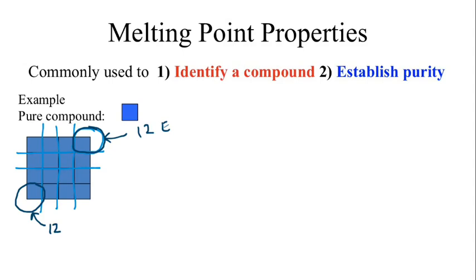Well, how are we going to monitor that energy unit? That's going to be with temperature. So if we're going to look at an ideal pure compound, all the intermolecular forces within that compound are the same. So when I hit the threshold of temperature that it clears that energy barrier, I'm going to transfer from a solid to a liquid at an instant. So it's going to happen really, really quickly.